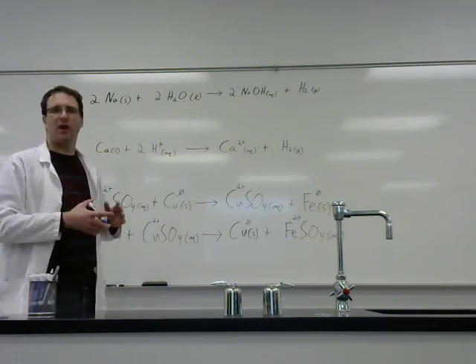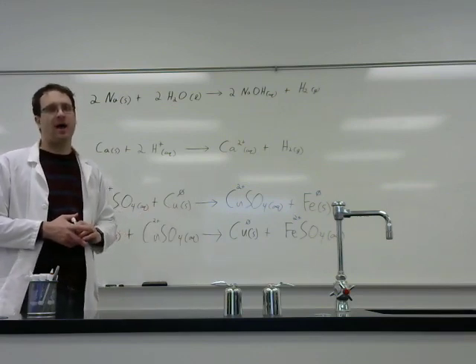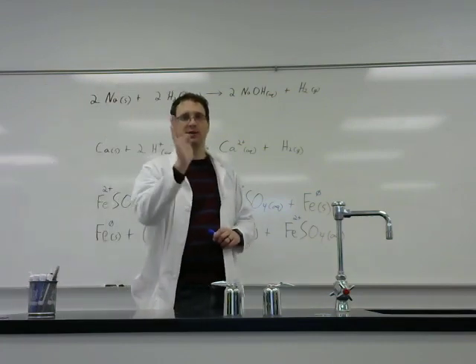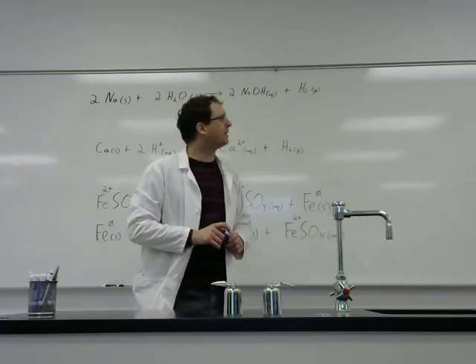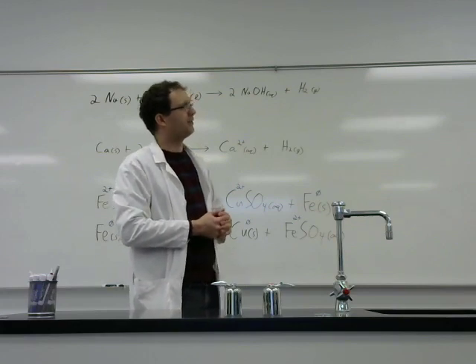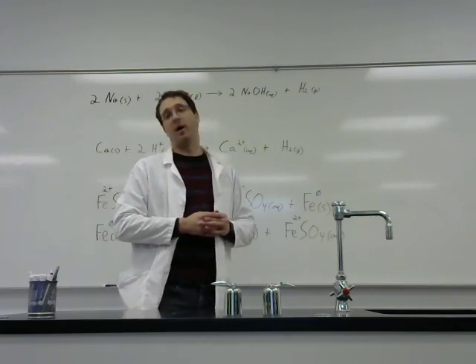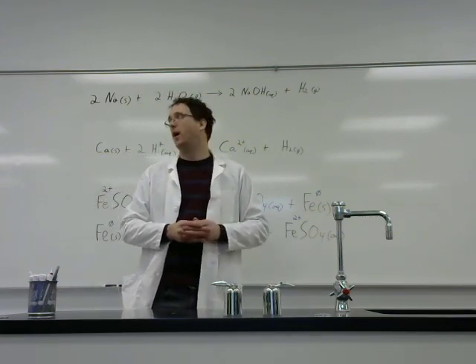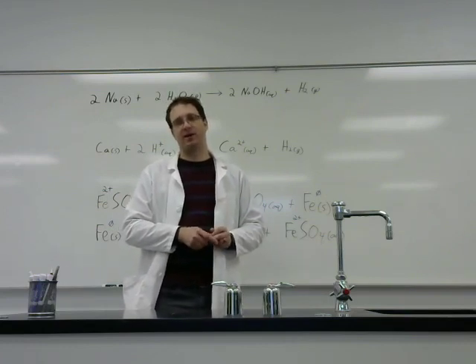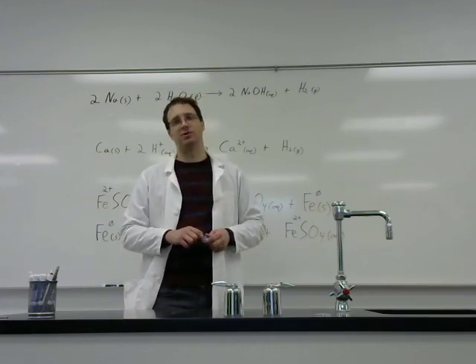So we'll have one way to predict our electrochemical series, and then we'll verify it through these sorts of reactions here. Ultimately, we're looking at metals that are in the same column or in the same row of the periodic table, and we're going to make a distinction between the main group metals, which are ones like in columns 1 and 2, and over on the other side of the periodic table, like aluminum in the P block of the periodic table, as compared to transition metals that are in the D block of the periodic table, and there could potentially be some complexity and some differences between those two groups.